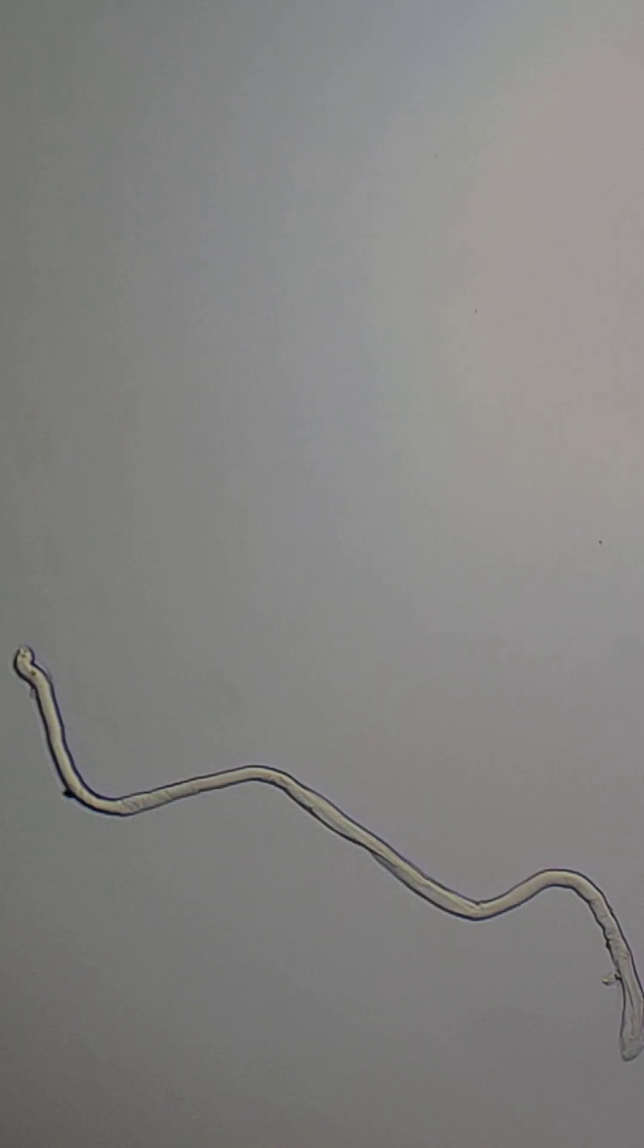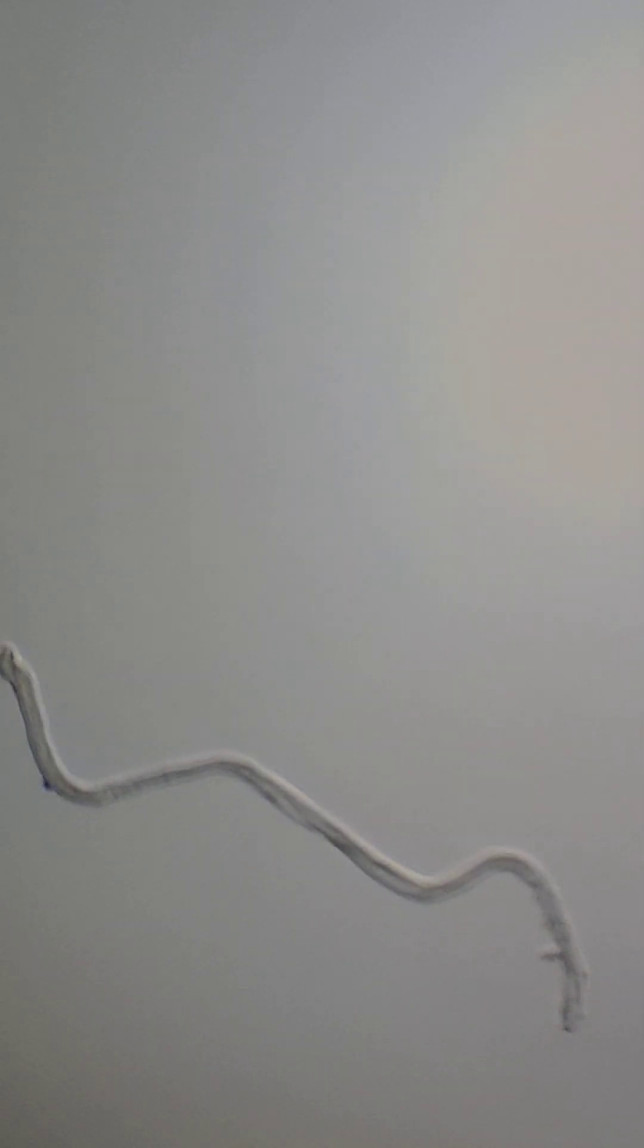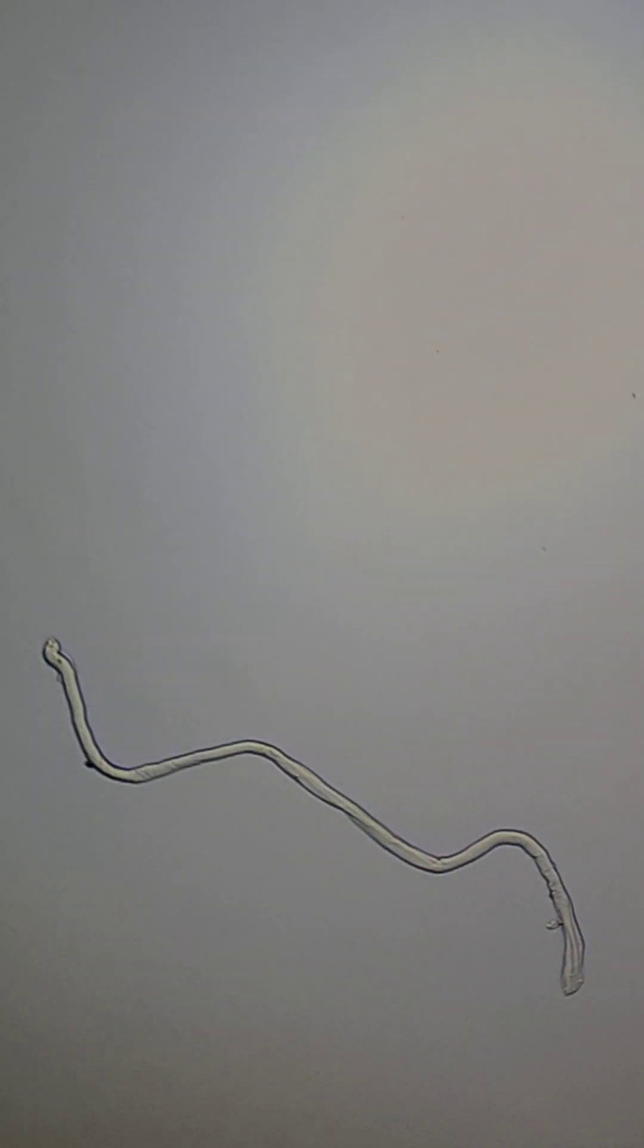More little symplasts here and there, another one. This is another interesting, I think another nano tube or ribbon, I don't know what it is. More light, looks like another tube. 400 times.